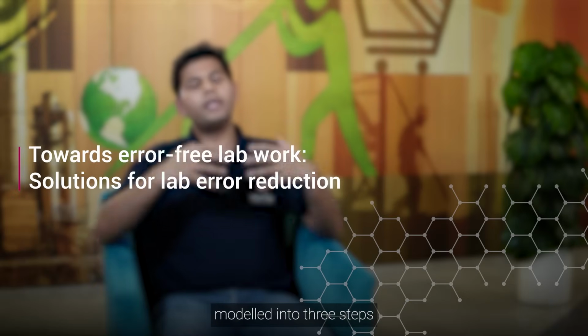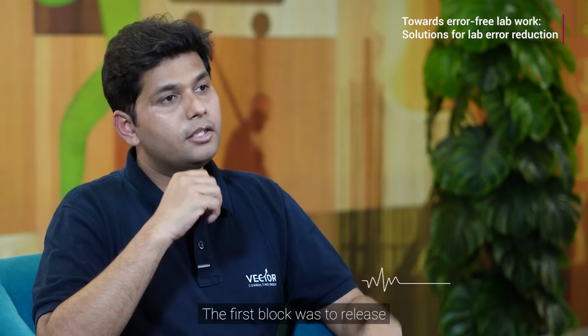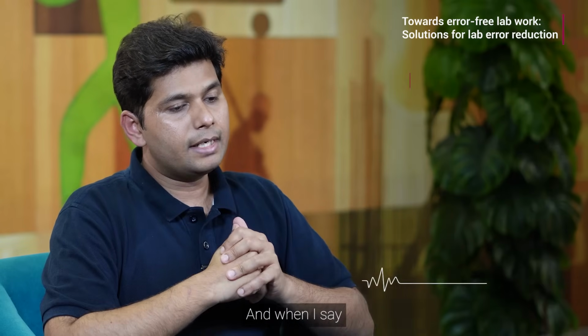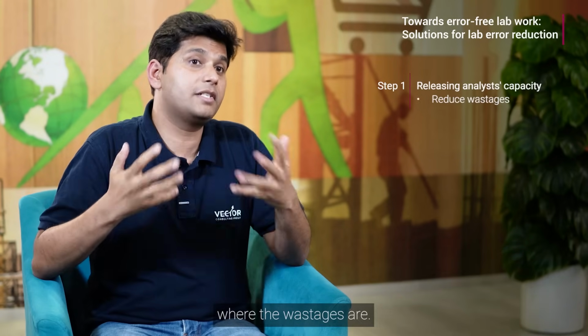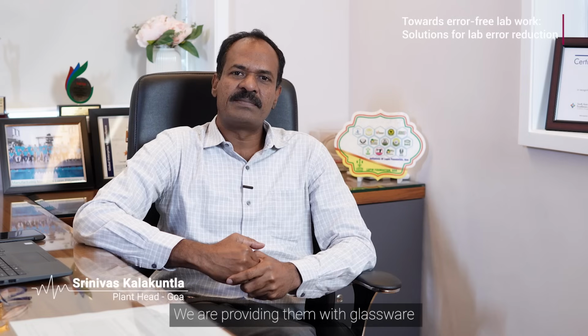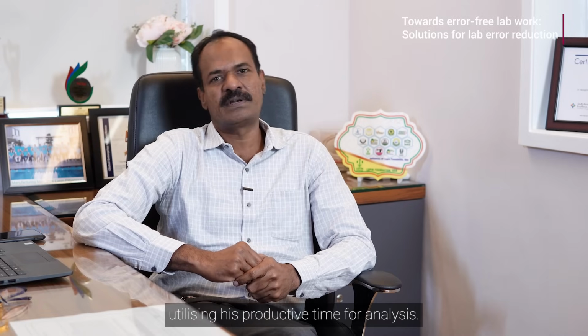So the entire solution was modeled into 3 steps, 3 essential blocks. The first block was to release the analyst capacity. And when I say releasing the analyst capacity, we wanted to understand where the wastages are. We are providing them glassware and the required things at place, so the analyst is utilizing his productive time for analysis.